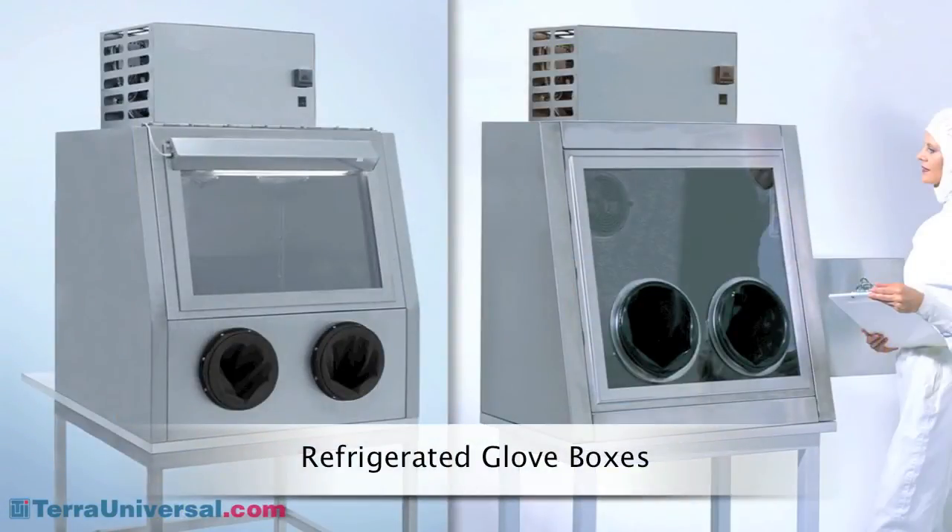Double wall insulated chambers are ideal for low and high temperature processing. Tera's temperature stability module, shown here, maintains constant temperature levels between minus 2 and plus 36 degrees Celsius.